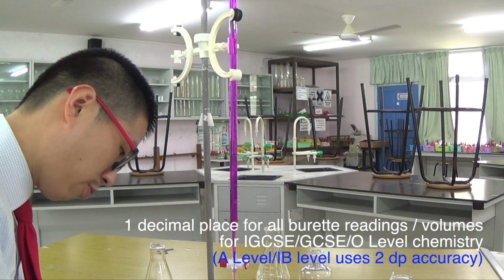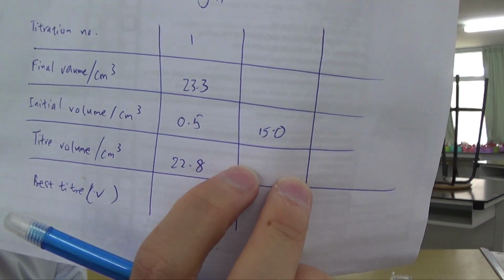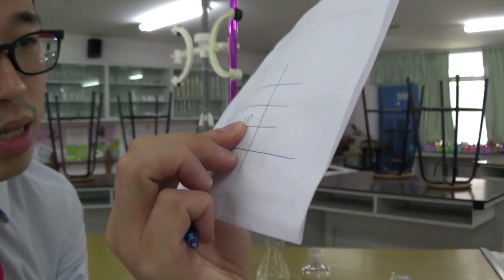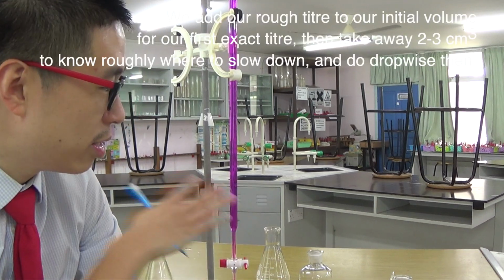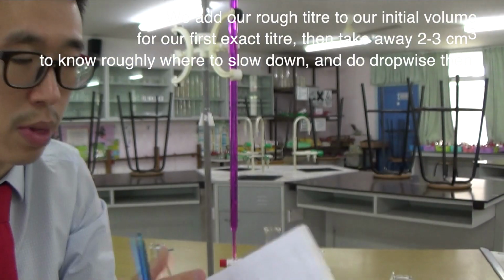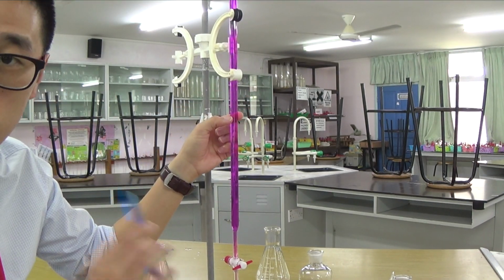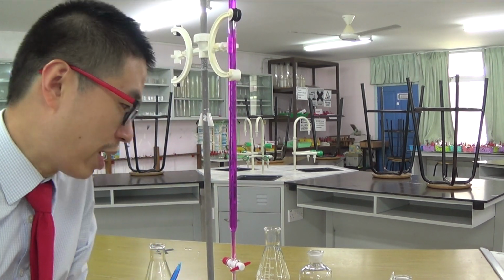So 15.0 for my exact titration, 15.0 plus 22.8, so give or take 23, 23 plus 15 is 38, but 38 would be in excess, though not by a lot. So if I take away 2 cm cube, since just now I didn't overshoot by a lot, 38 minus 2 is 36. So I will slow down and do drop by drop when I reach 36, but I will not do drop by drop from the very beginning because that would be a waste of time since I already did a rough titration.